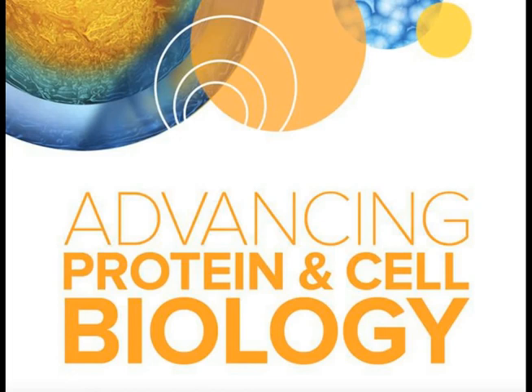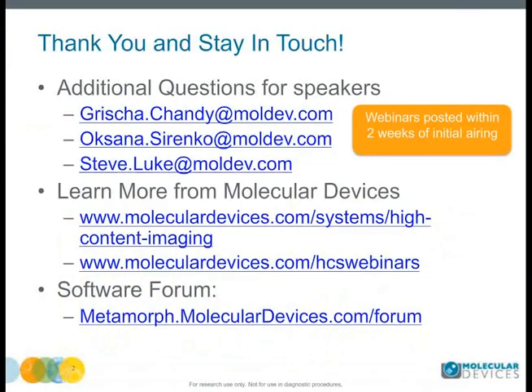Oksana, did you compare the behavior of compounds in 2D or 3D, and what were the results? Yes, we have done this study. A set of compounds was compared for hepatocytes in a 3D system and also compared with our previous data done in a 2D system with the same cells and a similar protocol. Cells were treated for 72 hours and then stained for viability markers and then analyzed by using cell scoring for live or dead cells.